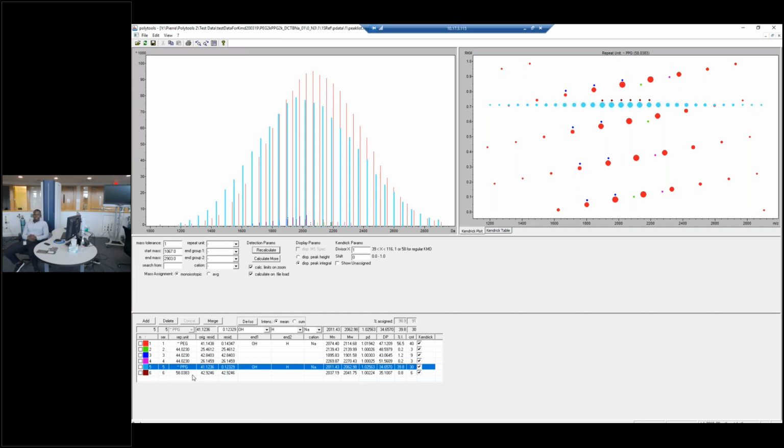Thank you. I think I will take the next question. Can you make demos showing how the various sample preparations are performed? For example, dry deposit, sandwich method, etc. Yes, I think that very well could be our next demo. Yeah. So I think we're right around the time allocated for this demonstration.